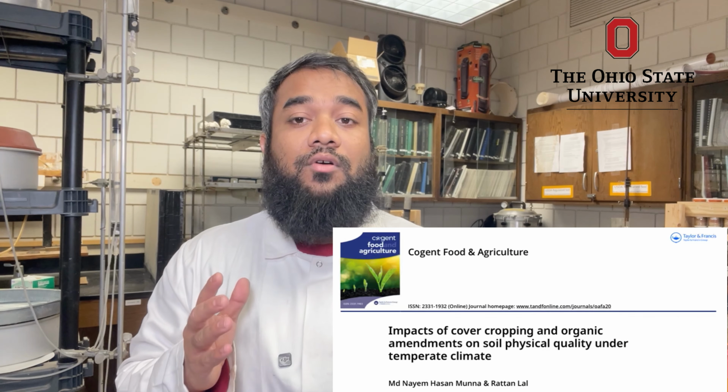So this is how soil bulk density is measured using the core method with coarse fragment correction in a soil physics laboratory.